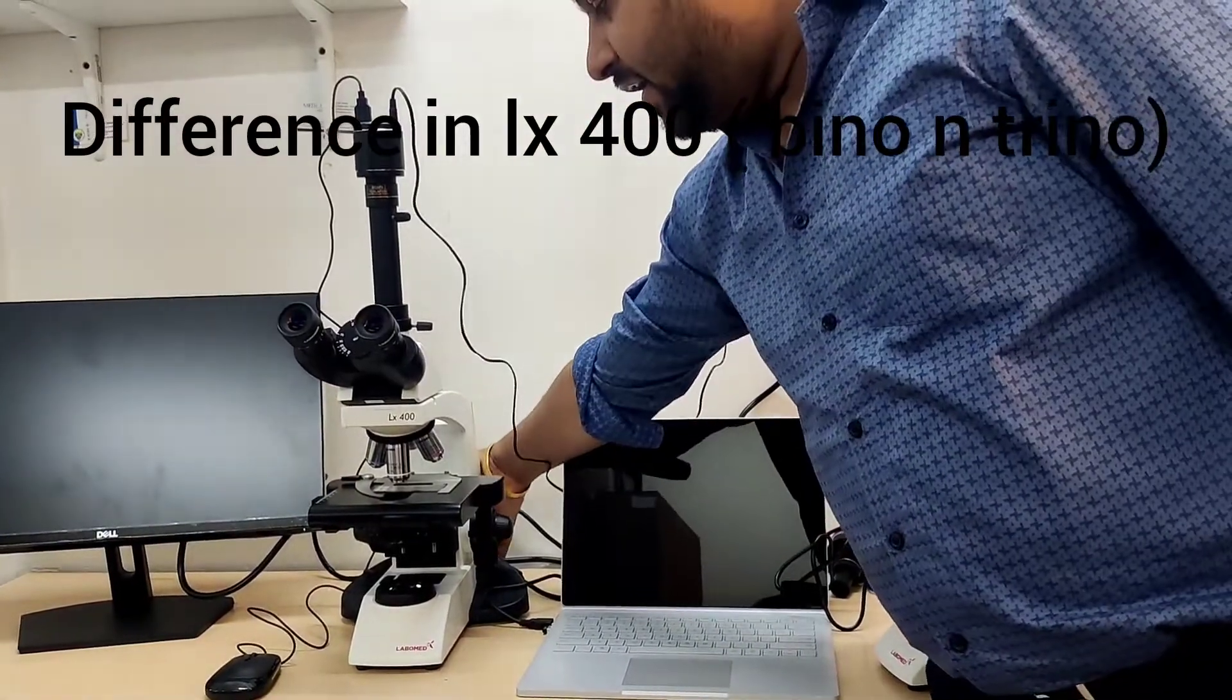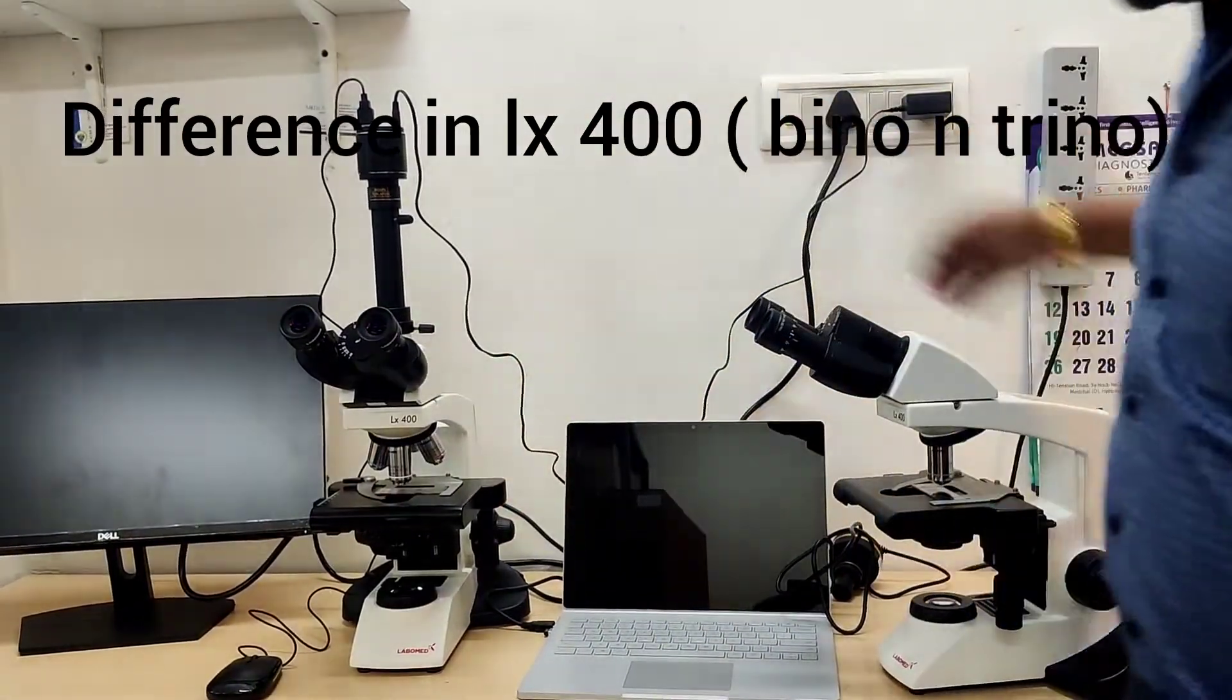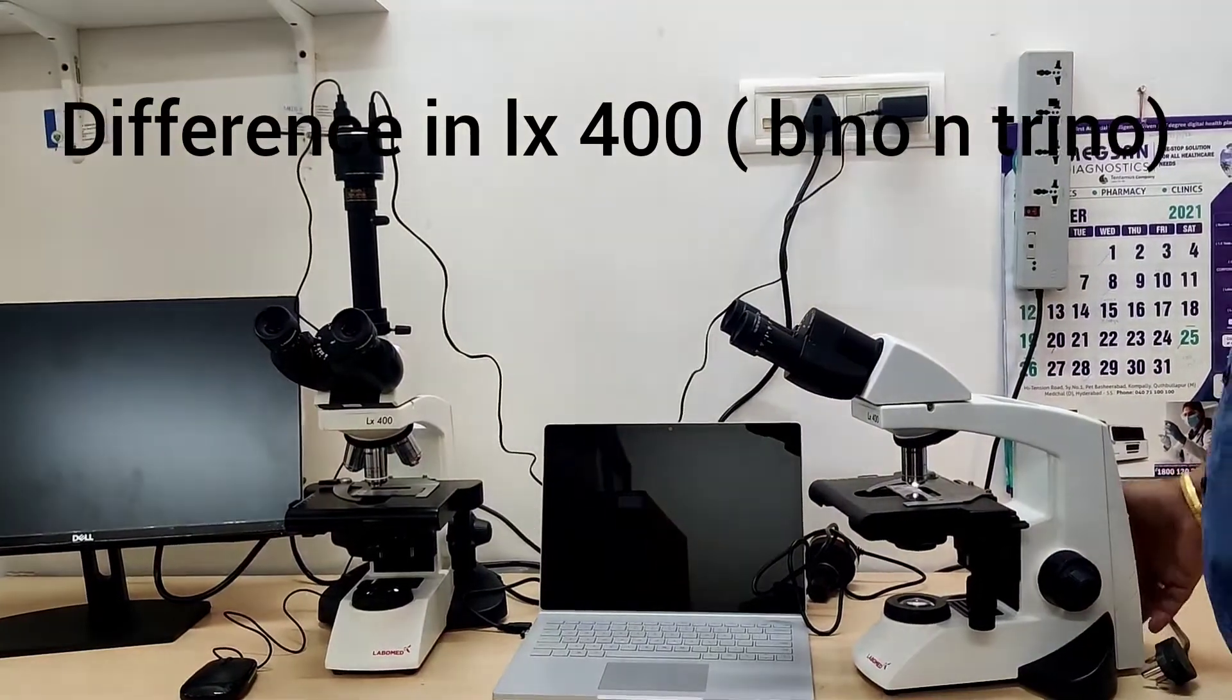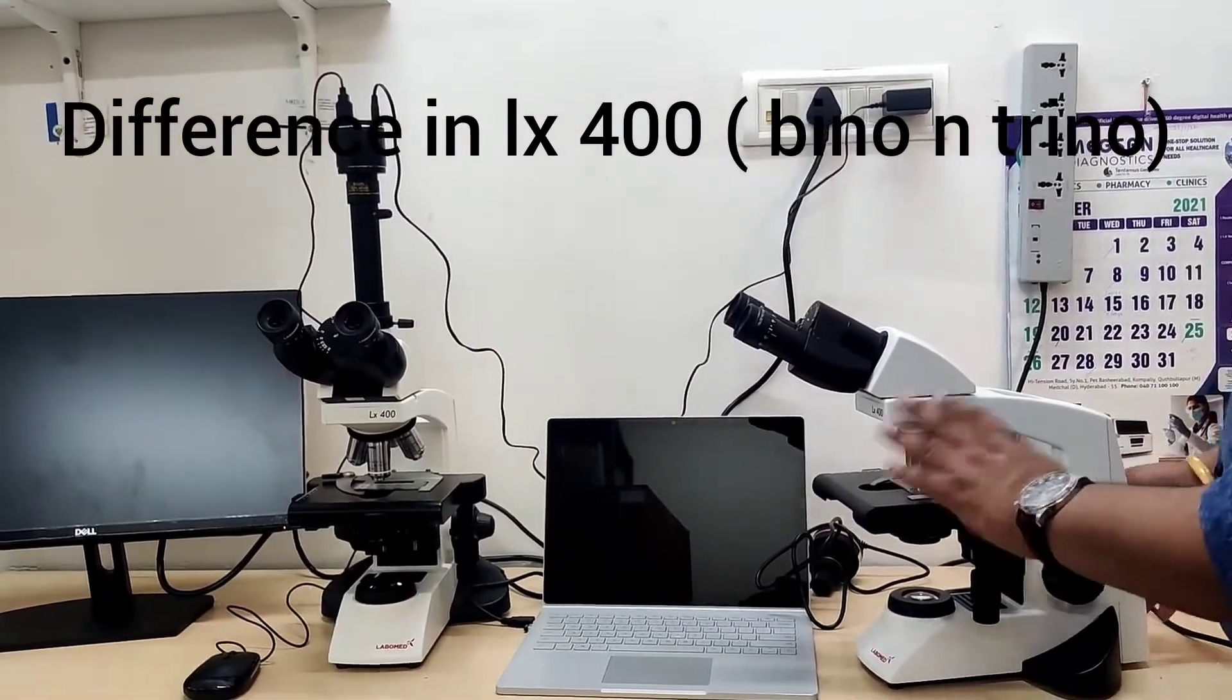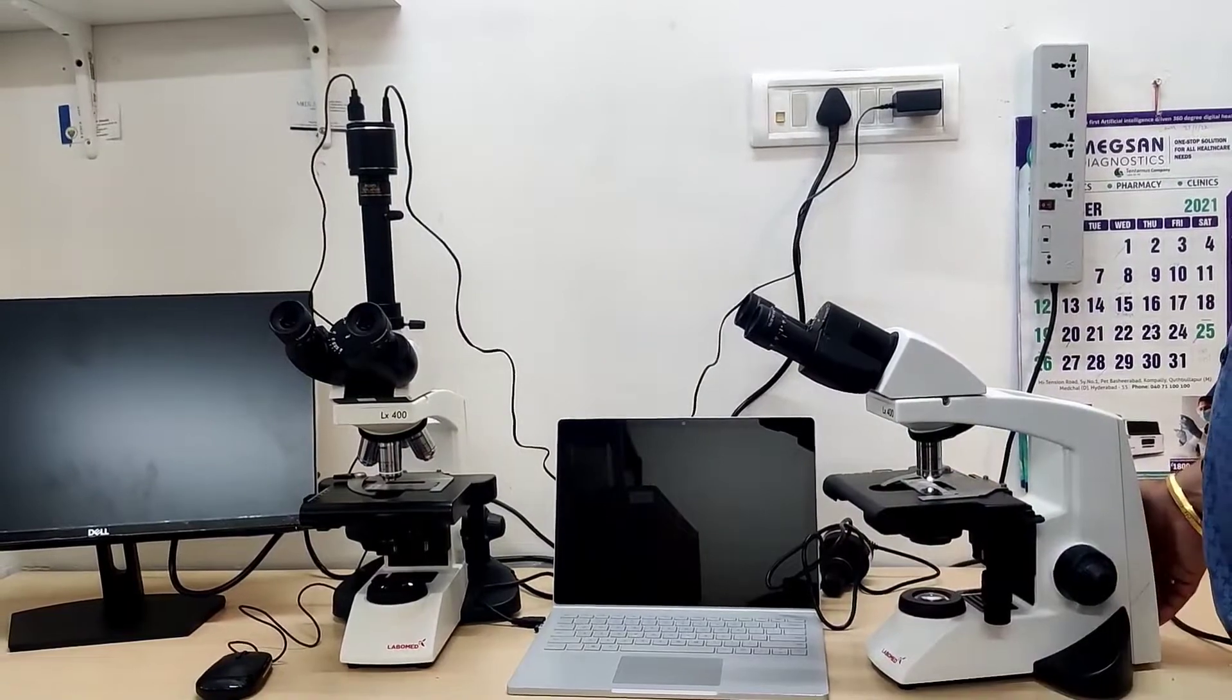Now you get an LED light with battery backup. Here you can see the LED light. There is no wire. Without wire it will work for 3 to 4 hours with the battery backup option.